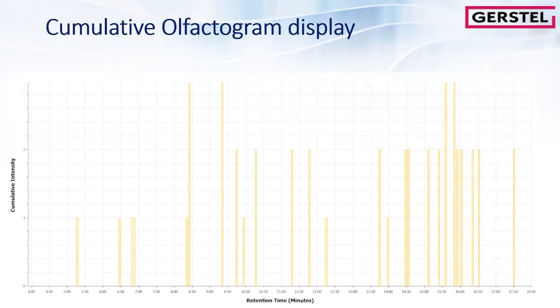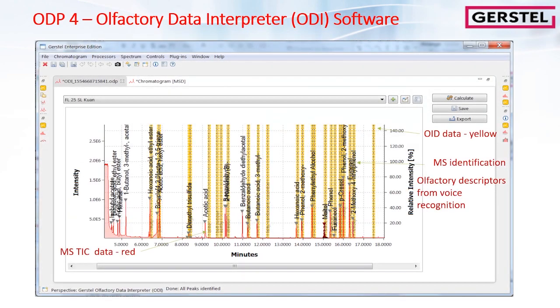The cumulative olfactogram displays intensities versus duration of detected odor regions. When a sample is evaluated in a multiple dilution or multiple panel list, the resulting olfactograms are combined and presented in cumulated form. The ODI software adds the respective odor intensities and displays the cumulative value. This screenshot shows how the total ion chromatogram data in red is overlapped with the compound intensity data in yellow and the text annotation obtained from the speech-to-text feature.